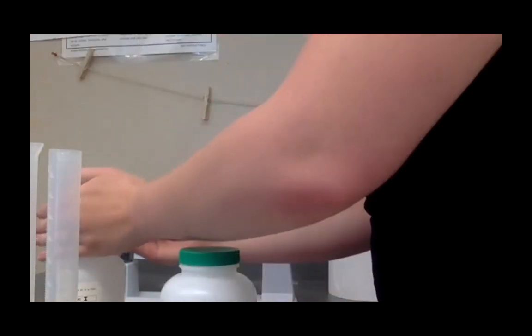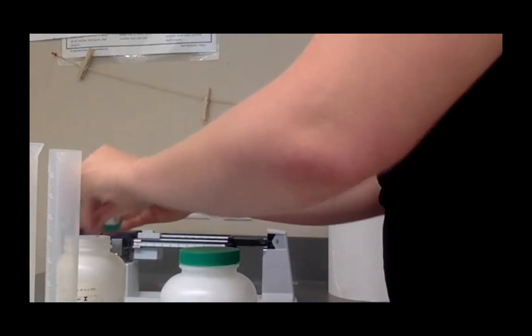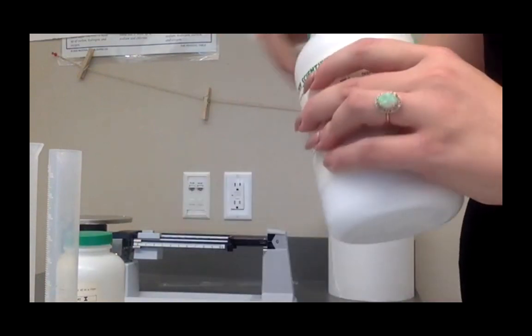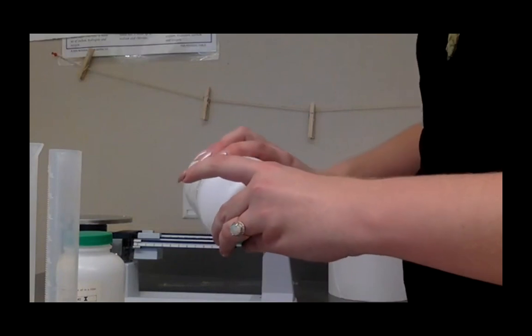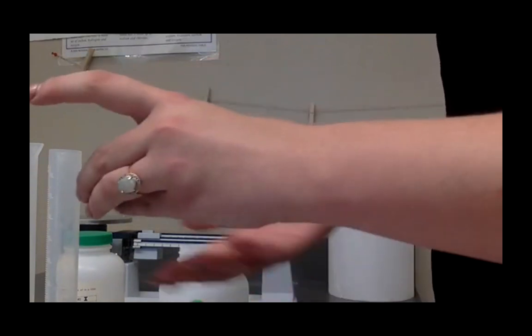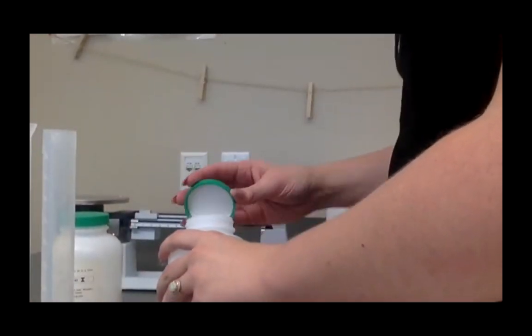Right, so that is road salt there. Definitely not the kind of salt we like to eat. And then we have glucose, which, as you can imagine, looks like sugar, right? Because that's what it is. So we got our glucose here, and then we're also going to be using water.